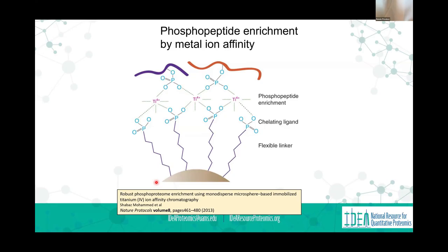Cell Signaling sells a pan antibody for phosphotyrosine that's actually quite good. The worst part about it is you've got to mortgage your house in order to buy it. First, you have to buy a license to do it, and then buy the reagents. It's really expensive because phosphotyrosine is really low level. You've got to start with milligram quantities of material, and so it makes it difficult.